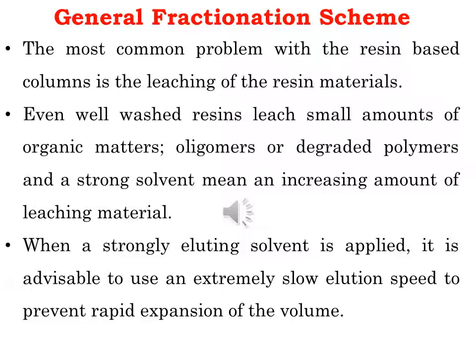Before use, the resin should be washed well and equilibrated with water to make it completely free from the organic solvent. When washing or equilibration is done in a column, a water elution of about 10 times the resin volume is recommended. When the resin is to be put directly into the ongoing fermentation medium, it has to be autoclaved first.